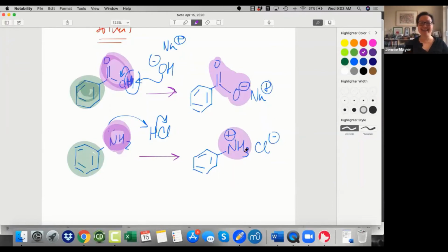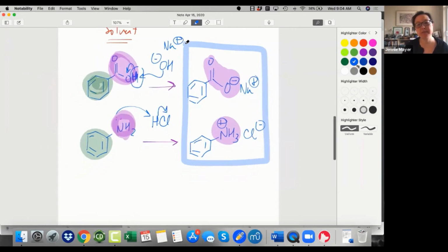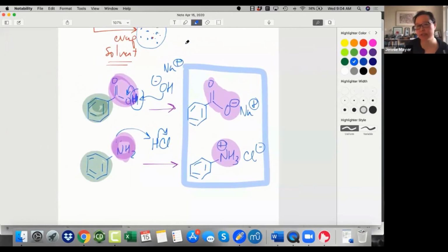All right, so then these become more polar. They will go into the aqueous phase. And then whatever other compound is there, if it's got a lot of nonpolar features, then it'll stay in the organic phase. And now you have a nice separation. That also helps you predict which compound is in which layer.